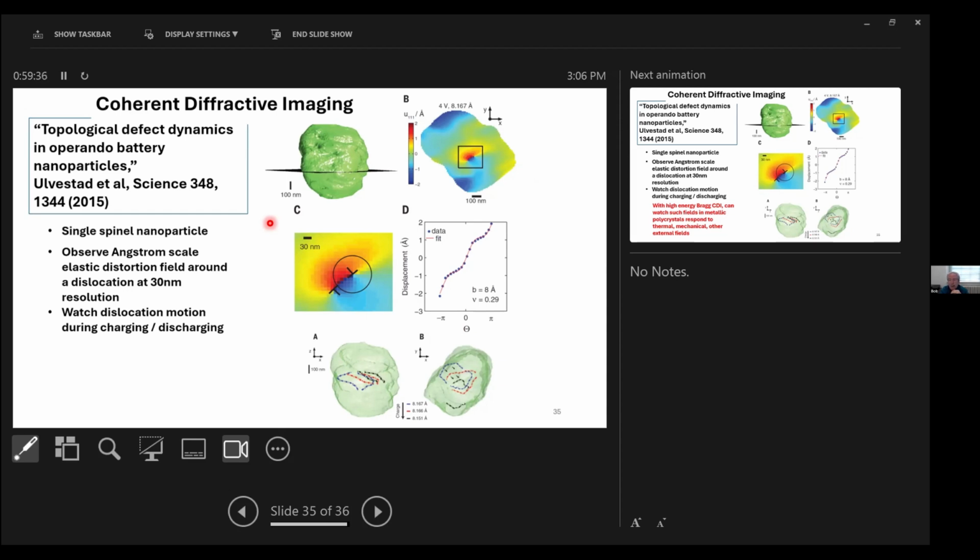The limitation in the standard near field measurement is just the detector resolution. So one solution to the limitation of the pixel size, essentially, of course, there's also the intrinsic resolution of the scintillator crystal itself, whether that spreads the signal out some.